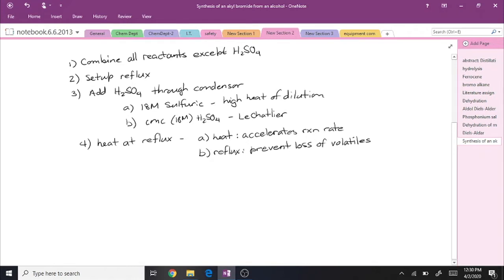Of course, anytime you're doing a reaction, the first step is going to be the design of the reaction, planning the protocols, design and planning. Once that is done, and we've done that for you, the next step is to actually execute the reaction. So at the end of the reflux, we will have done that, but then we always have to separate and purify our product.